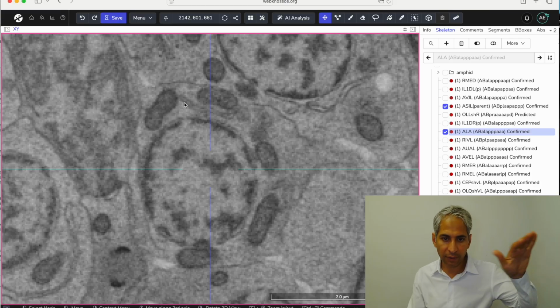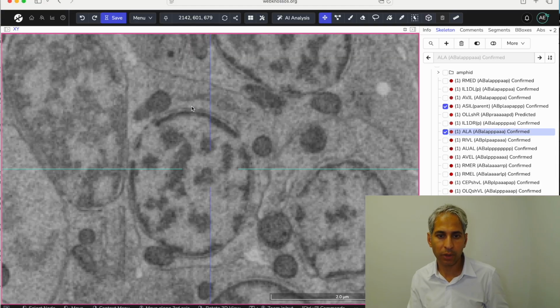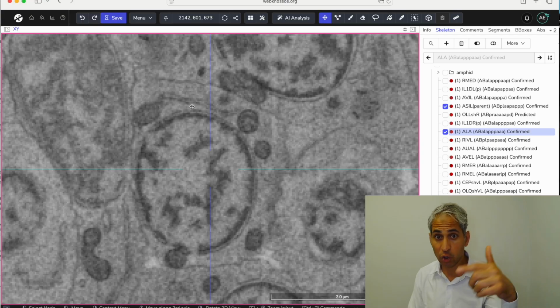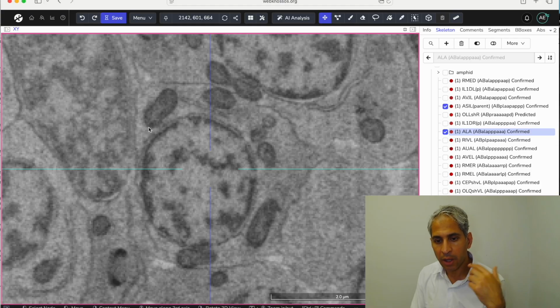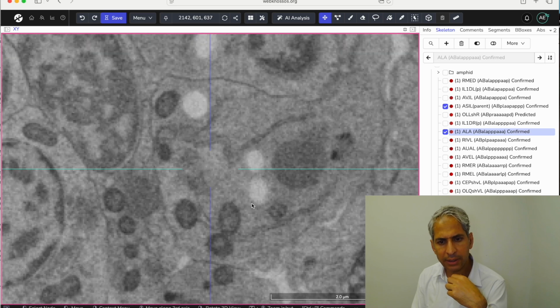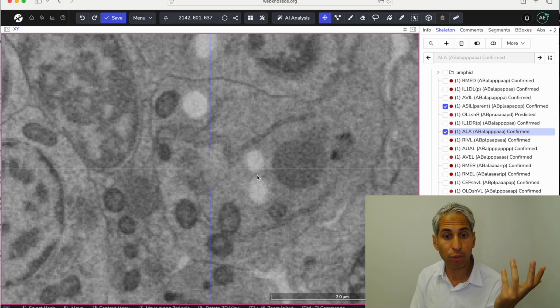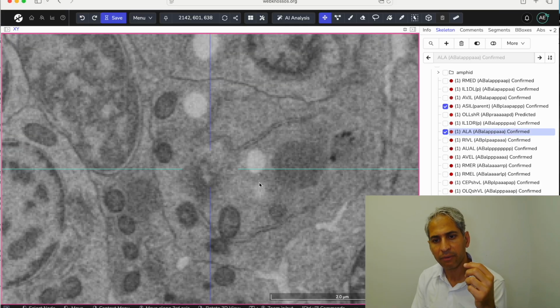Endoplasmic reticulum, different story. This is maybe a part of an endoplasmic reticulum. It's too thin to be a mitochondria. So I'm telling you my reasoning, my process here. So what else is filling the cell other than these shapes? Let's see. There are some of these clear biocondensates. I don't see any membrane surrounding them, so they look like they're membraneless, unless the membrane is not being stained darker.